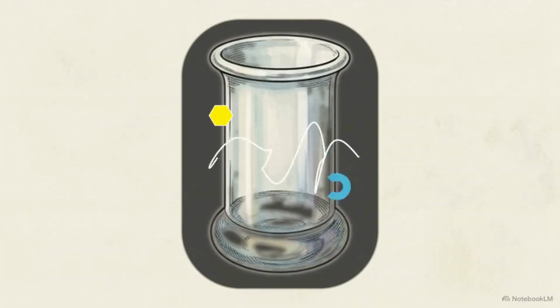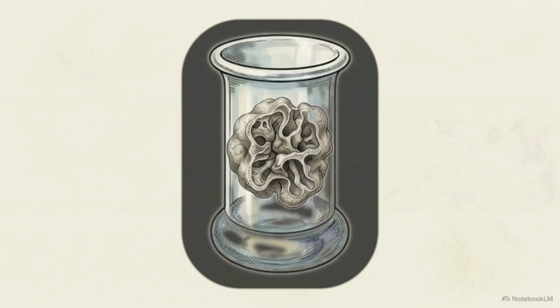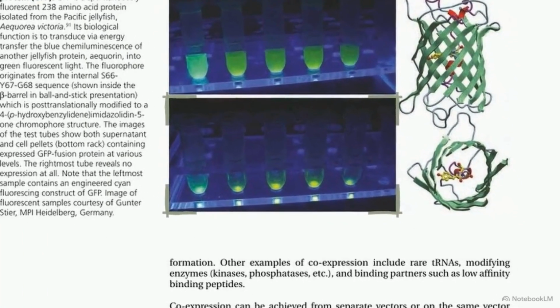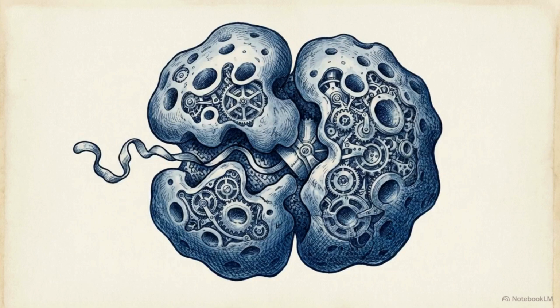They can precisely add synthetic lipids, folding chaperones, and redox buffers to orchestrate assembly in a test tube. The result of this isolated expression is pure, concentrated material, clearly visible in these test tubes of highly expressed green fluorescent protein. Mapping the architecture of life is not achieved through lenses. It is the result of re-engineering biological machinery.